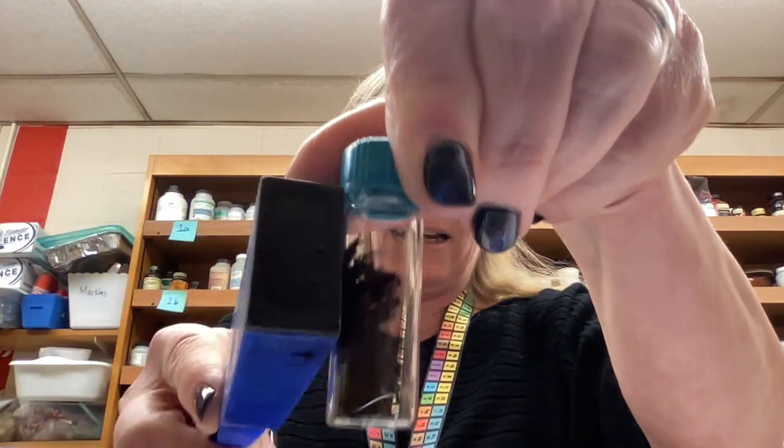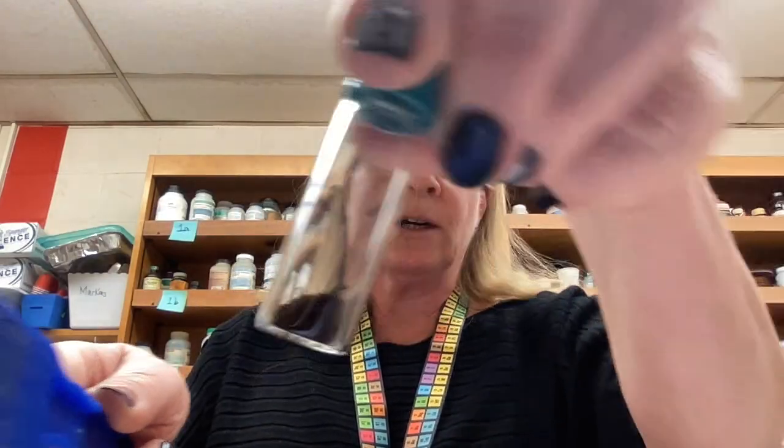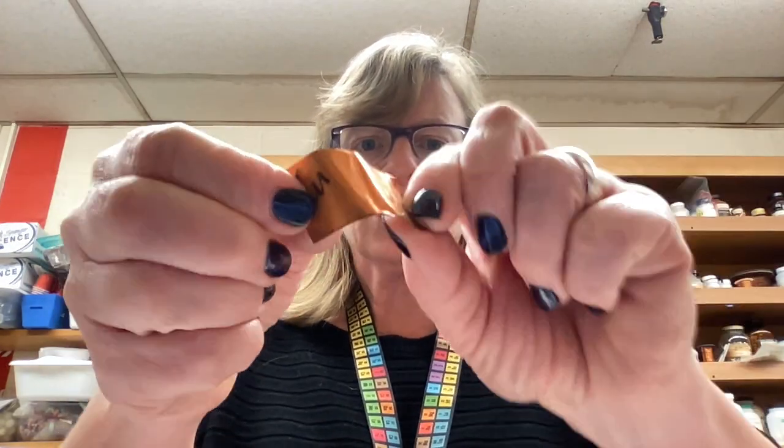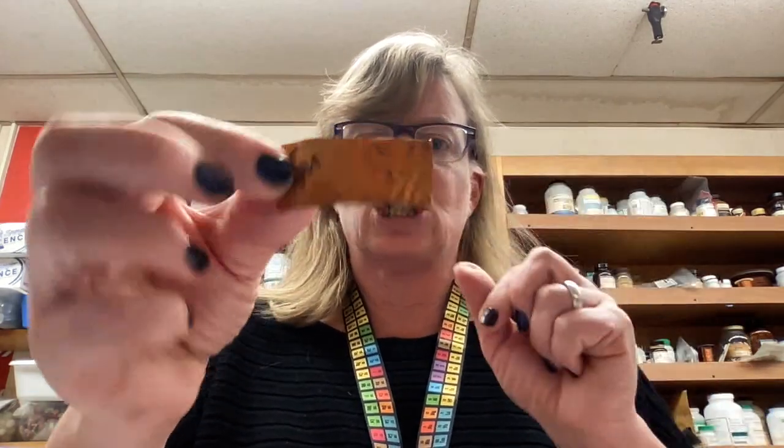Okay, so we're going to start off. This is iron. Fe is iron. And I do want you to see that iron is magnetic. Okay. So you can see the color, sort of like a dark brown, black, gray area is one physical property, and another physical property is it's magnetic. Our second sample is sample B, copper. Copper is Cu. You can see it has a coppery color. It is also what we call malleable in that you're able to bend and work with it, and it's shiny. Those are some physical properties.